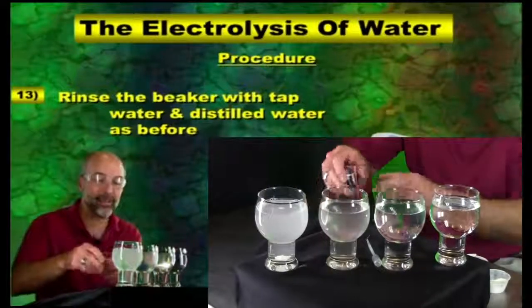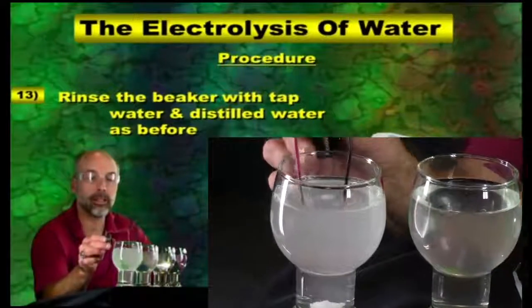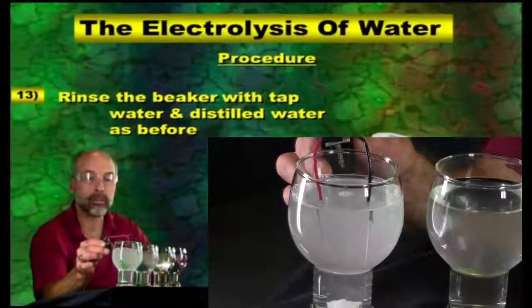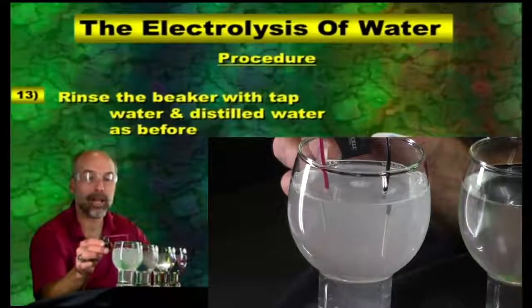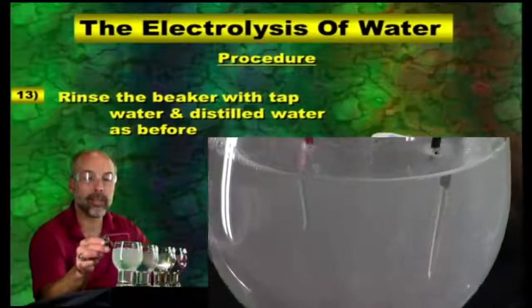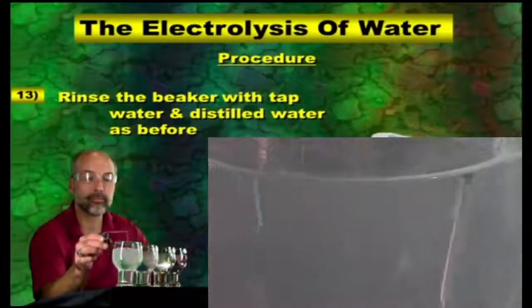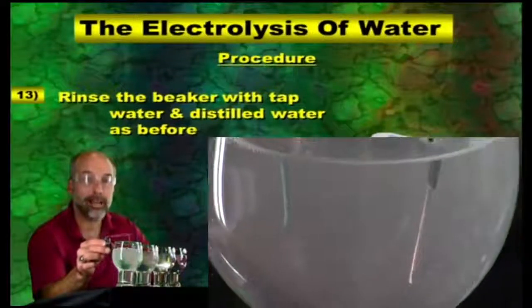So let's go ahead and we're going to take our wire again from both ends and set it in here and see what happens. Oh my goodness. I am seeing lots and lots of bubbles coming off of this thing. Lots and lots and lots. So it's apparent that this actually is ionic also.